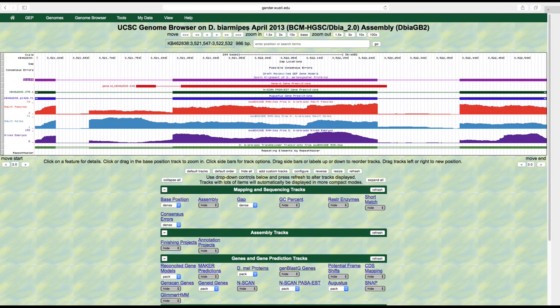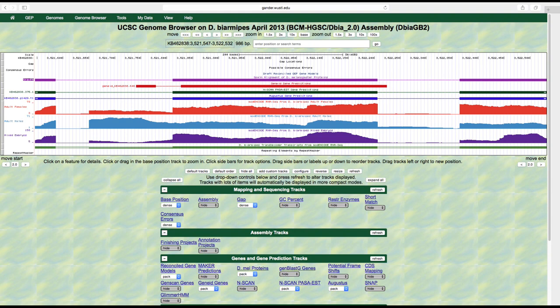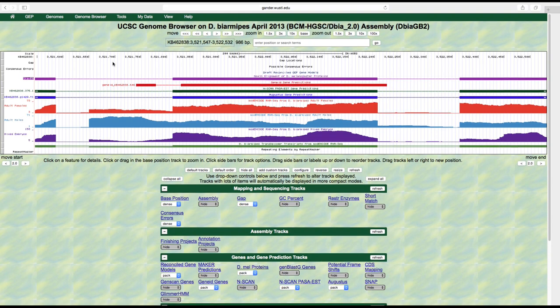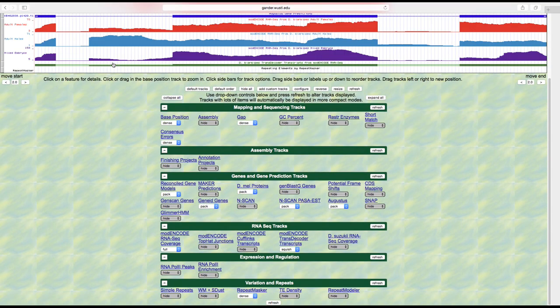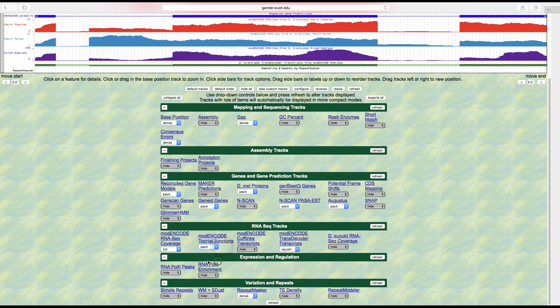We are now navigating to the genomic region that contains the presumed tra-ortholog in the Drosophila biarmipes whole genome assembly and will examine the evidence tracks for the presumed ortholog. Scroll down to the RNA-Seq track section and then change the display mode for the modENCODE TopHat junctions track to pack to view the individual splice junctions.